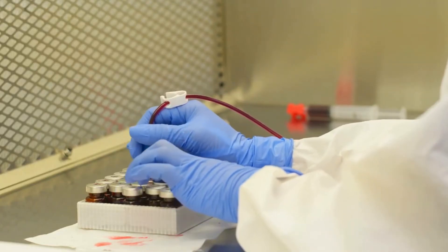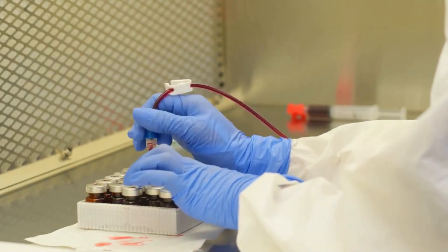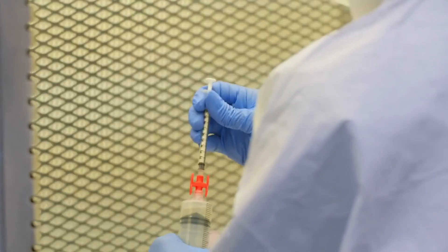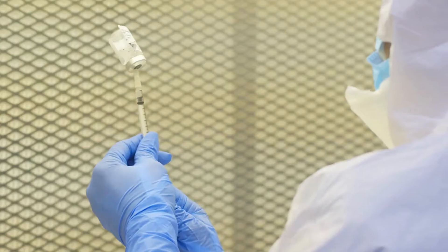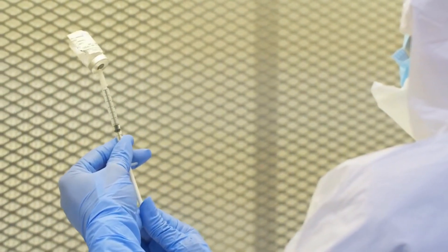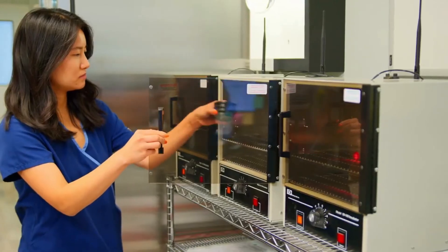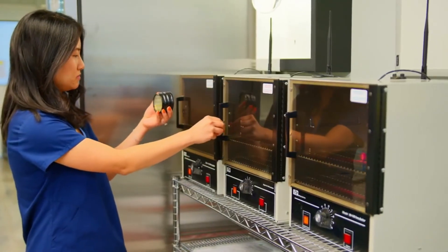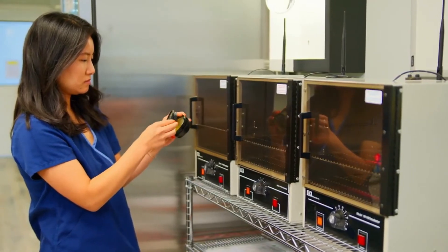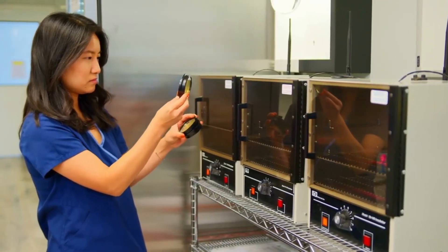Our labs are designed similarly to what a pharmaceutical company would build, which is why many pharma companies and universities contract with us for clinical trials. It is imperative that we keep our clean rooms absolutely free from any contaminants. Clean room testing is performed monthly, yet the FDA requires clean rooms to be certified only twice a year. We also utilize environmental monitoring systems to continually monitor temperature, humidity, and pressure in all of our sterile labs.